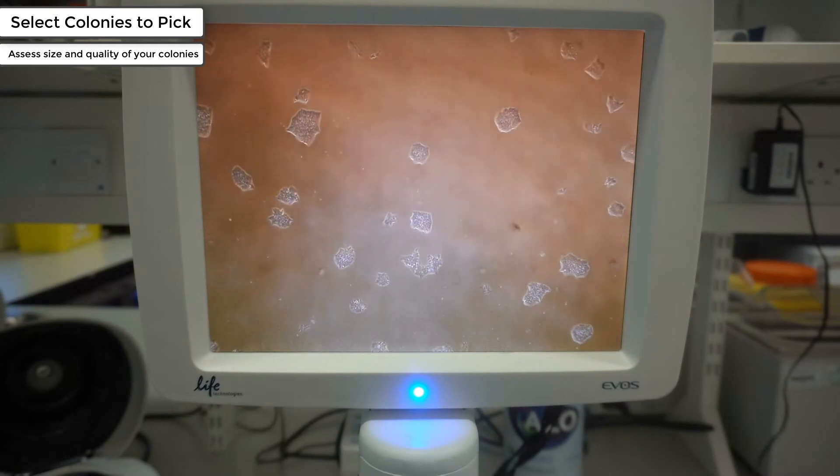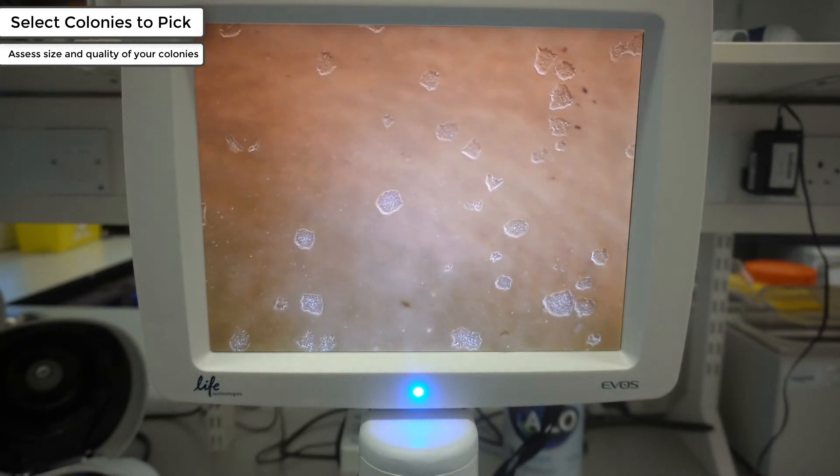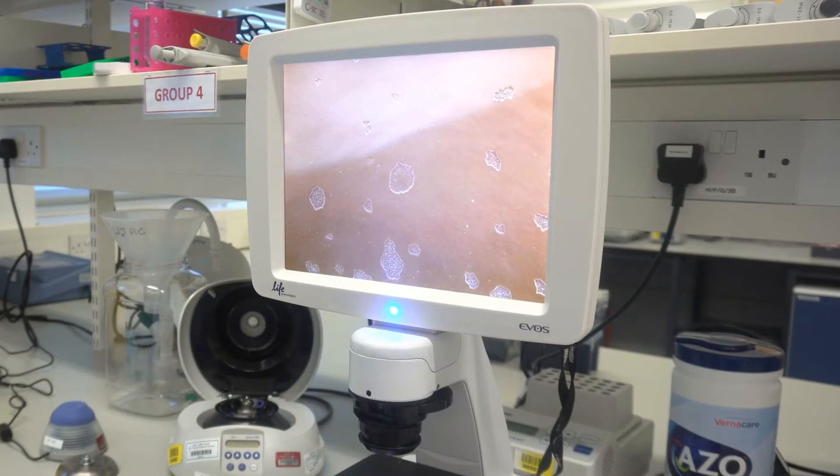This colony is on the smaller side for colony picking, so I would recommend marking this colony and observing it a couple of days after this initial observation. Hopefully it will grow bigger and have a more round, defined edge before picking. I'll be selecting this colony for colony picking — it has a small spike and is slightly on the smaller side, but sometimes there isn't a perfect ideal cell.